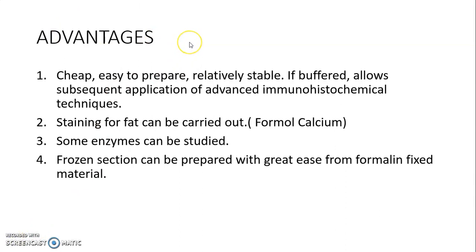So, advantages of formalin: it is cheap, easy to prepare, and relatively stable. If buffered, it allows subsequent application of advanced immunohistochemical techniques. Staining for fat can be carried out if formal calcium is used, if calcium is added in formalin. Some enzymes can also be studied if formalin is fixative. Frozen section can be prepared with great ease from formalin fixed material.